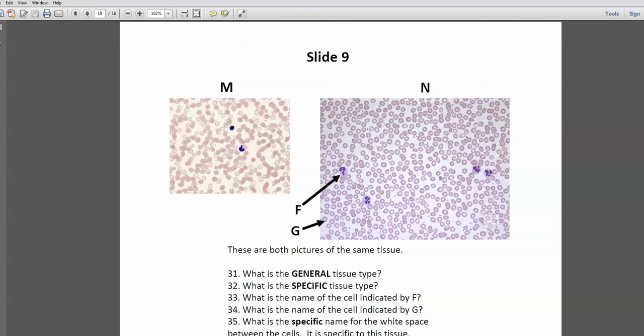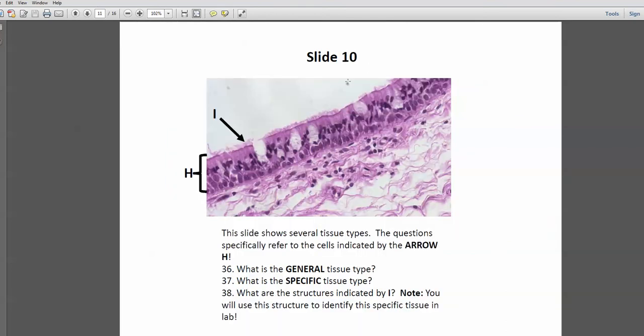Number 10, we have a free space and we have bunches and bunches of nuclei beside one another. So we know this is epithelial. So now we need to identify the shape. Well, the nuclei look elongated, so these are columnar cells. And of course you only have two choices, either simple columnar or pseudostratified columnar. And I told you in lab that if you find cilia, you know it's pseudostratified. So this is pseudostratified columnar epithelial.